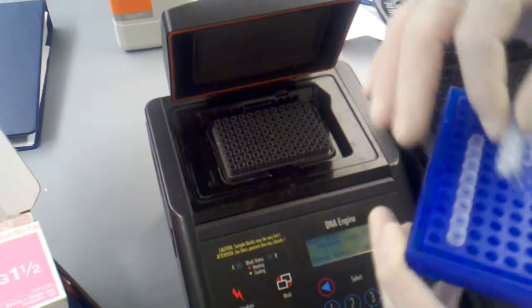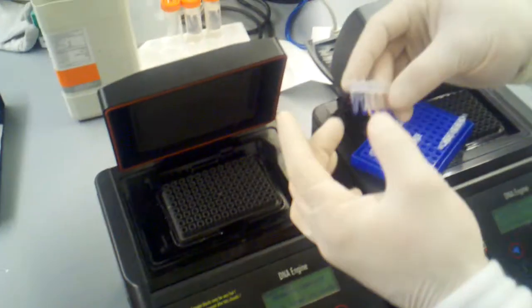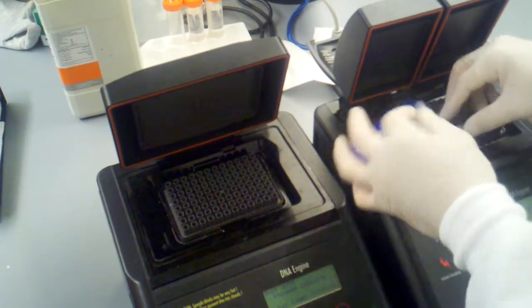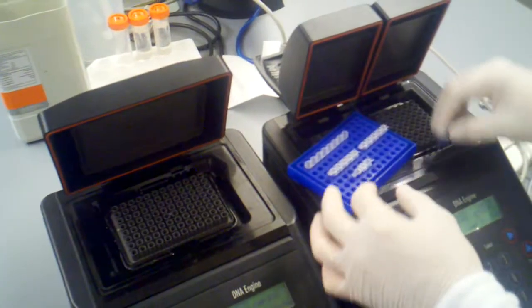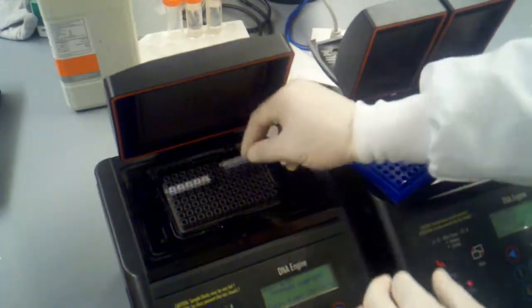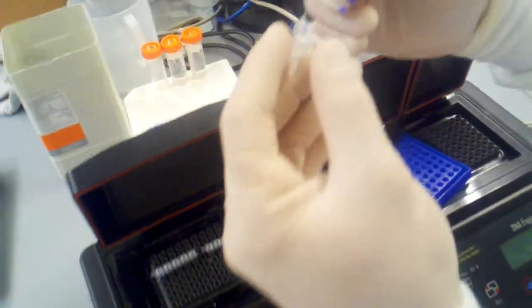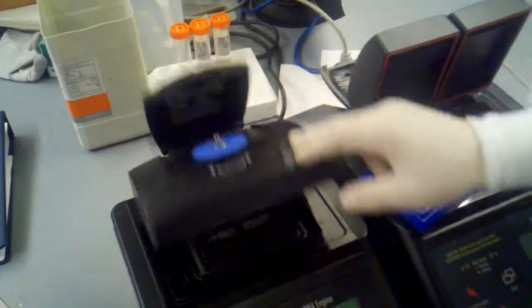I'm going to kind of tap them down. You know what? We should probably do a little bit better of a job mixing this, so I'm going to give a quick flick. A little quick flick. Make sure it's all nice and mixed up. Nice quick flick. Tap them down. And pop them in. Making sure that there's not any liquid on the top, because if there was, I might centrifuge it down. So our samples are now in the thermocycler.